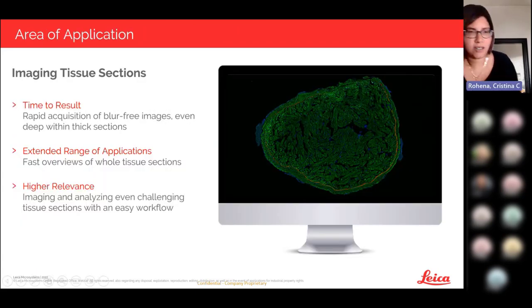So what is the area of application really for our tissue imagers? That really is tissue, tissue, tissue. You're able to now image tissue sections much quicker than you were before. Our upright systems are also equipped with 4 and 8 slide holders, if you so choose, to also increase the throughput of your tissue acquisition.